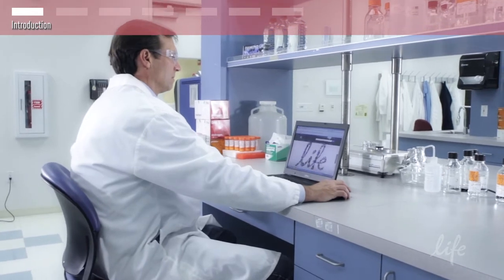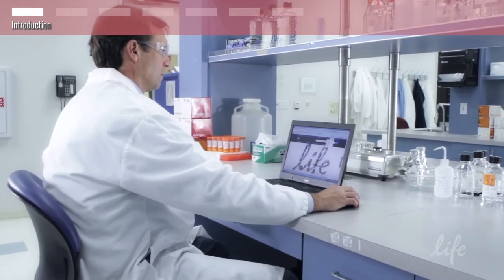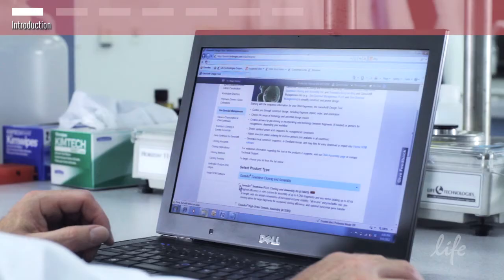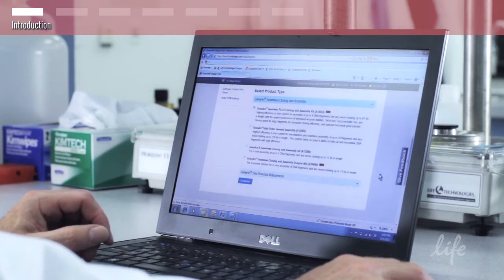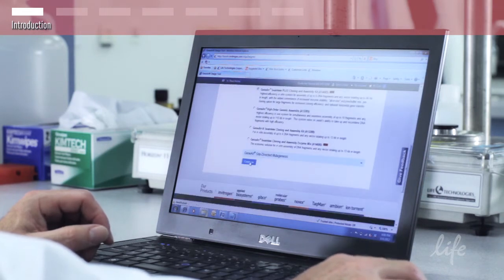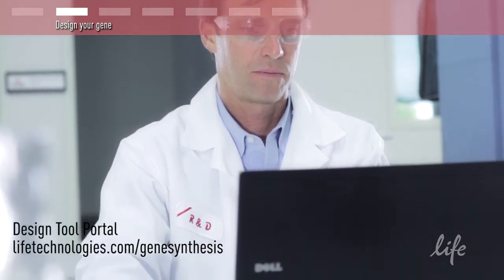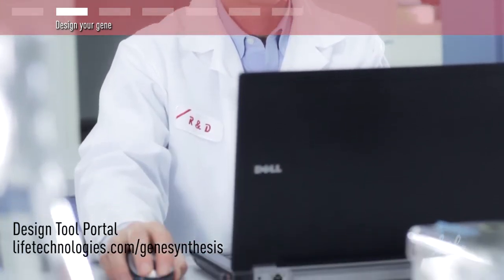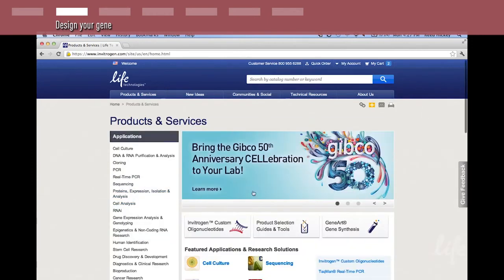The process begins with ordering your gene from Life Technologies through the GeneArt gene synthesis services. The first step is to design your genes by going to lifetechnologies.com/genesynthesis. Once at the web portal, log in or create an account.